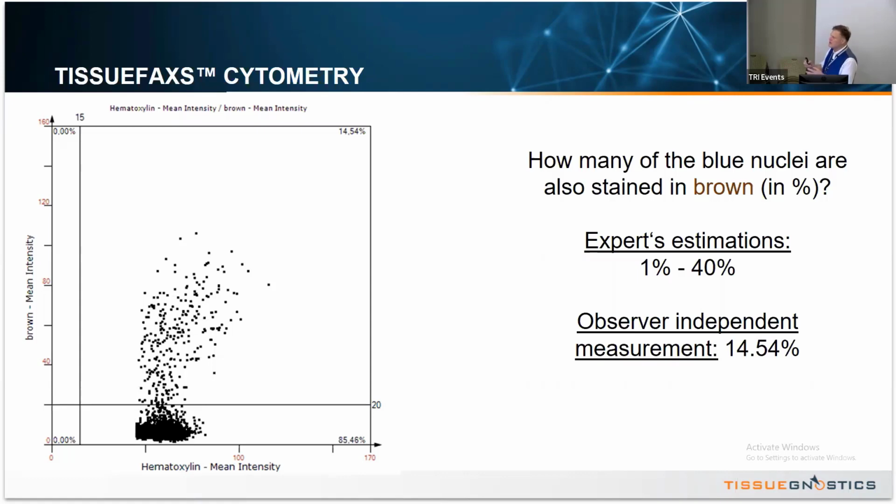It's the same procedure that has been established in flow cytometry, called the isotype matched negative control, on which you set this cutoff and then apply it to your samples. And this will give you the number of positive cells. The good thing is you will always have the same number, whether you do the analysis on Monday morning, Wednesday noon, or Friday afternoon, here in Brisbane, in Sydney, in Vienna, in New York.